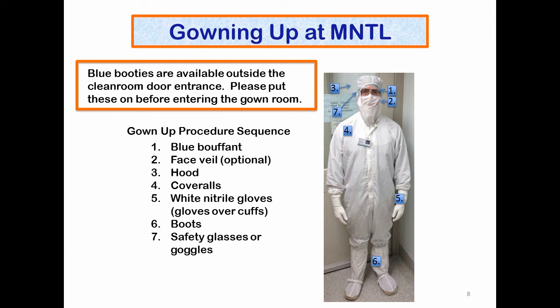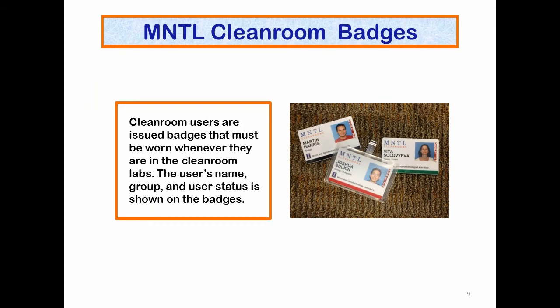You wear a cleanroom hood. Then you put on the coveralls. White nitrile gloves. Gloves are over the cuffs. Finally, you put on boots and safety glasses. And then you're ready to go into the cleanroom.